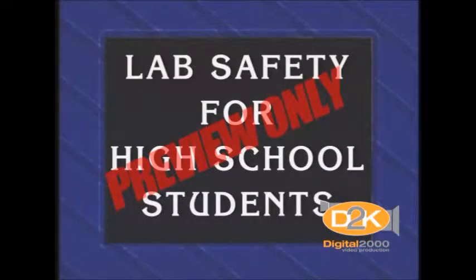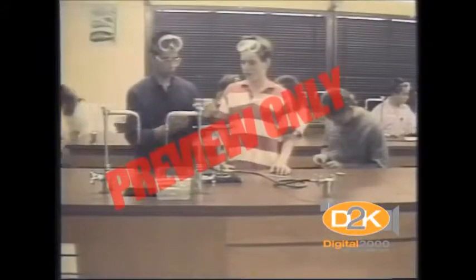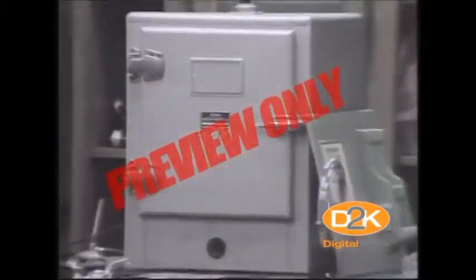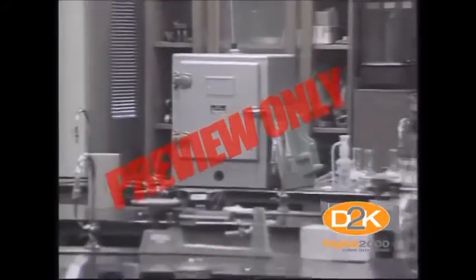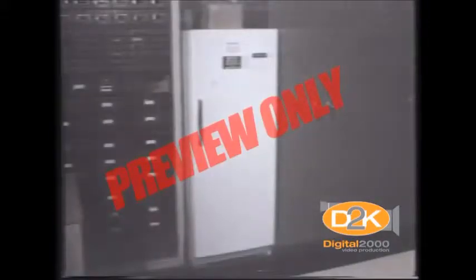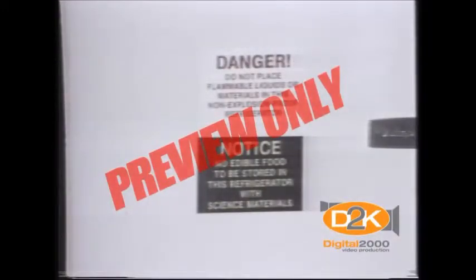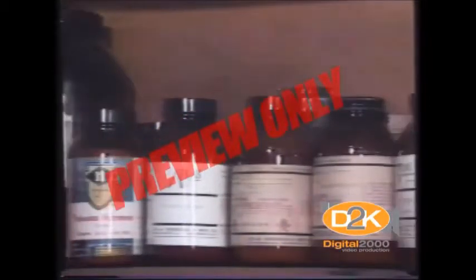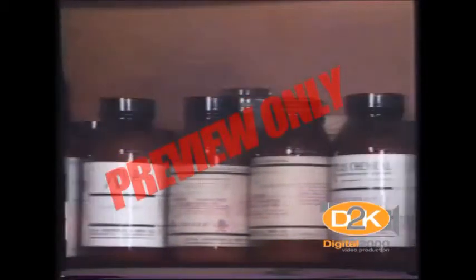Lab safety is extremely important, not only in high school lab classes, but also for any industrial, commercial, even home laboratories. Think about safety every time you do anything, because it doesn't take much to cause a serious accident or injury. First of all, this program will not list all hazards or potential hazards in a lab environment, and it's not intended to teach you everything you need to know about lab safety.